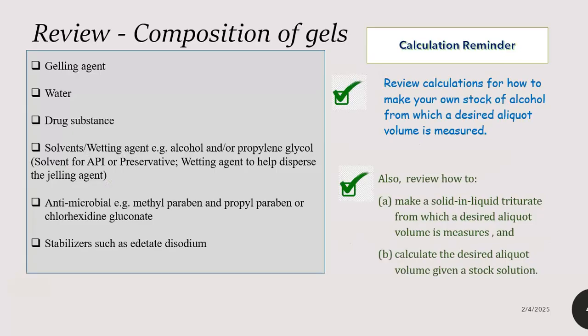And we are going to look at sample formulations and a basic method for how they should be compounded, and the techniques that the textbook really does not tell you, but over the years we have kind of understood the principles and we're guided by accuracy and how to minimize transfer loss. So some of the techniques that will be mentioned in this video, if you look at the references, they just give you a basic method.